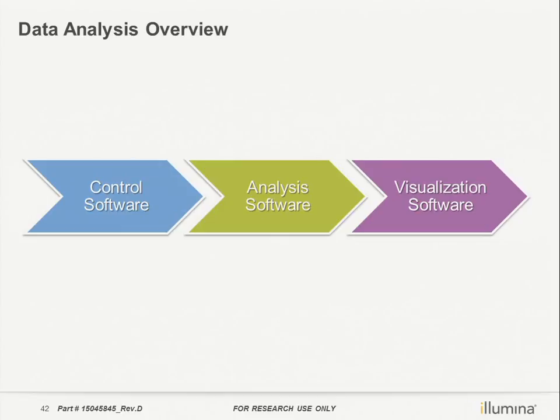So the analysis is in real time. It will not wait until you complete all the imaging and then launch analysis. No. After you complete the first cycle imaging, RTA will already process the image taken in cycle 1 and start doing the analysis. That's why we can much reduce the sequencing time.